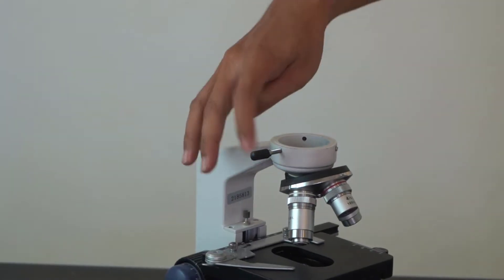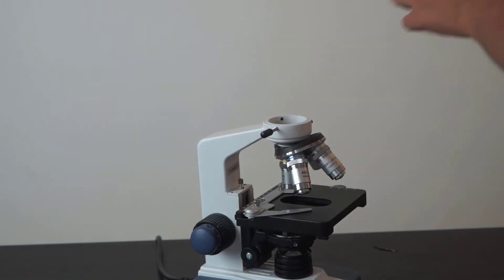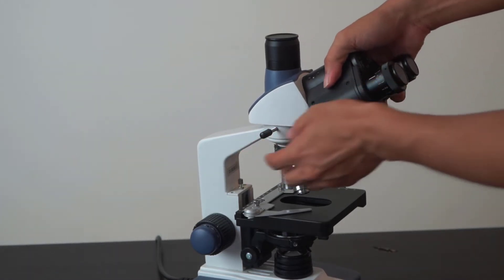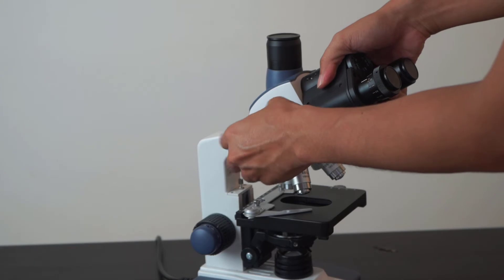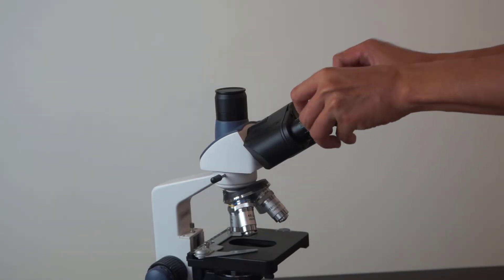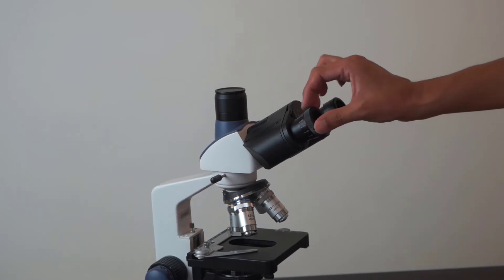On the side of the scope there is a screw which you can use to tighten the head of the binoculars. You can now insert the eyepiece into the binocular head.